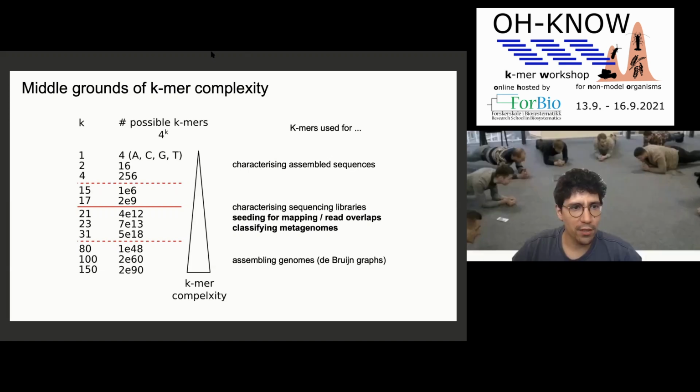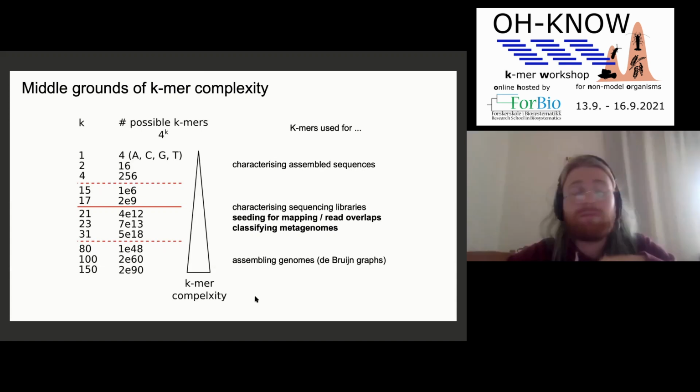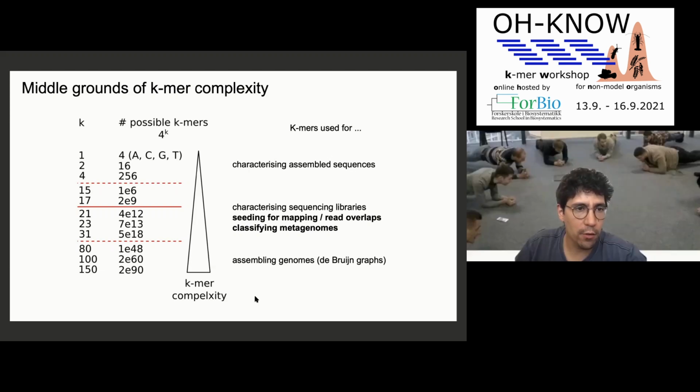You have 2 more questions, 3 now. So Irene asks, the use of single and paired end reads will only affect the coverage? Yes, practically. The paired end information is completely discarded when using Kmer approaches, usually. And then what is your prediction about the graph if you are using nanopore sequencing with an error that is known not to be random? By graph, I mean the Kmer distribution graph.